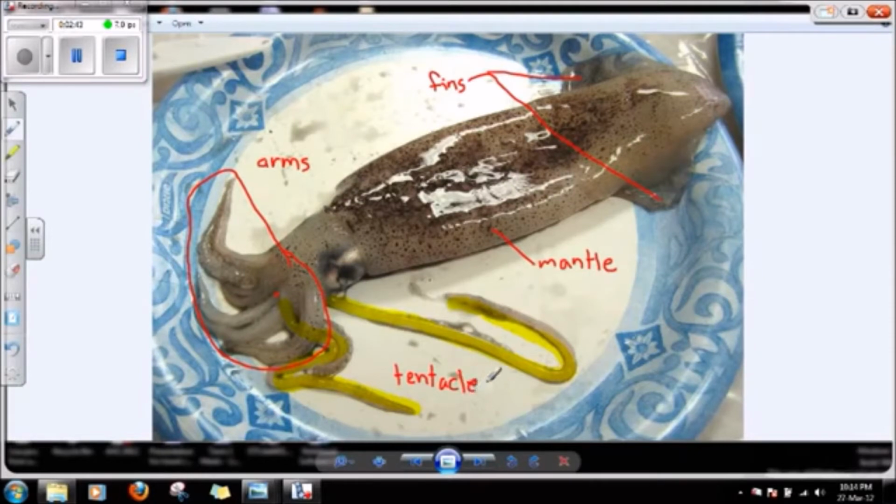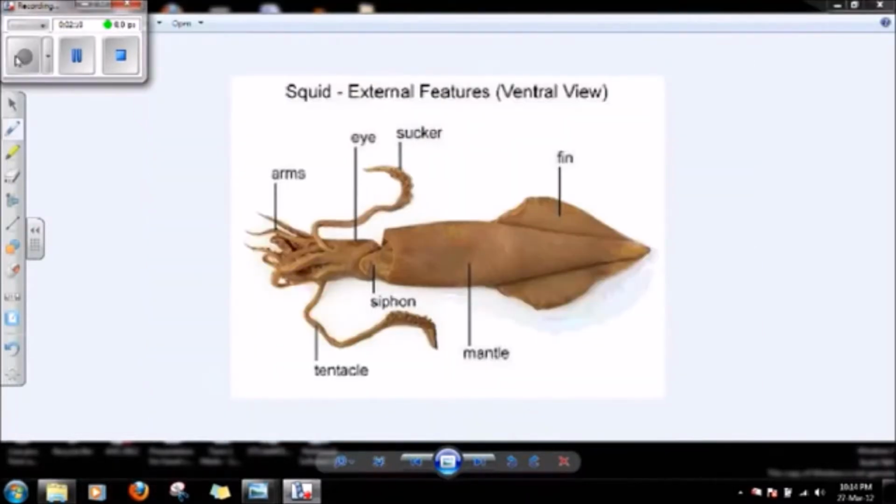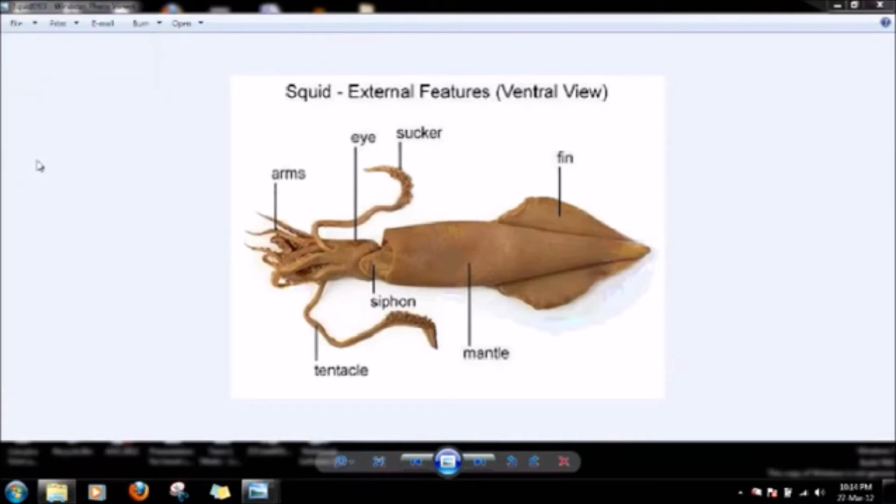Squid is an excellent predator. So it's able to grab things and can bite pretty hard with that beak, which is in the middle of a big, massive muscle. So when you do look at the mouth or the beak in the center of those arms, look for a big, massive muscle around it. Now if we flip the squid over, you can see what it looks like on the other side.